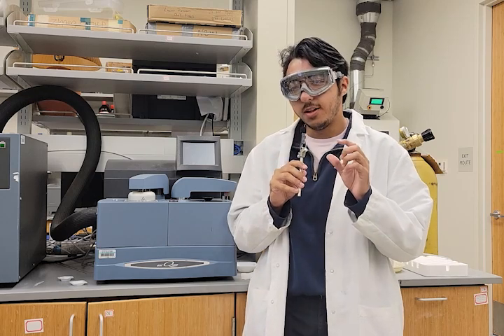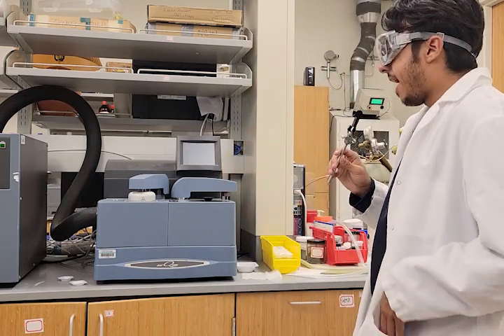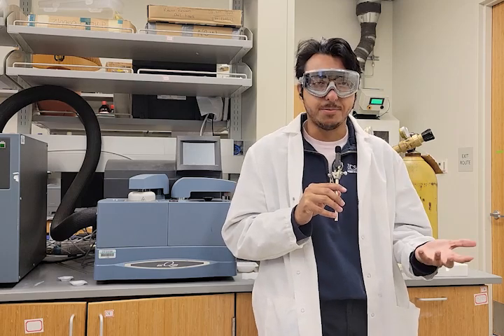Boom. All right, here we're at the DSC. It stands for differential scanning calorimetry. And in this instrument, we load our sample into little pans, and we heat them up really, really hot. For the purposes of this experiment, we're going from -50 Celsius to 250 Celsius. So not too hot, but still pretty hot, especially if you touch it with your bare hands. And it shows us important things like its melting temperature, its glass transition temperature, and its crystallization temperature.